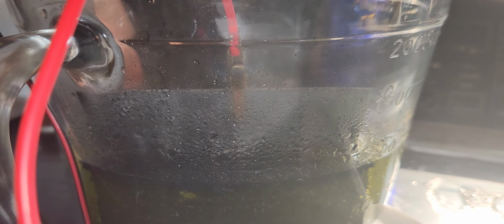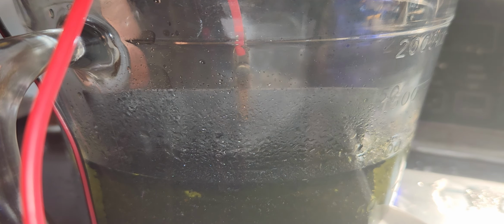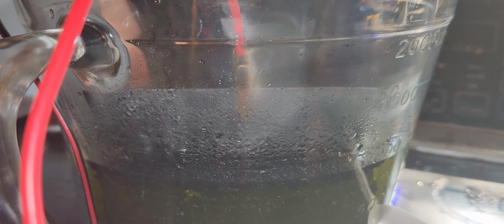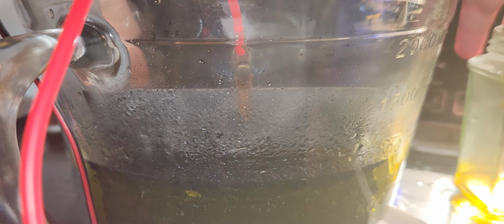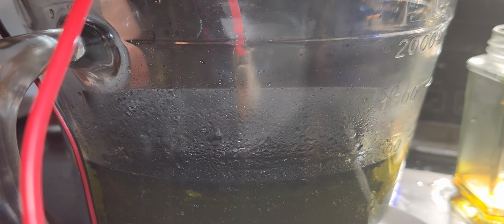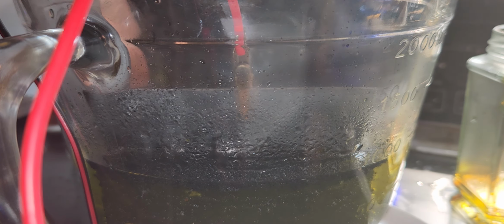What is this experiment? The negative is a copper electrode, which is in Dragendorff reagent with distilled water. As you can see right here, this is a little bit of solution of Dragendorff reagent, which I put a bit more potassium iodide into. And it's Dragendorff reagent, which is bismuth. It's potassium bismuth iodide, or potassium iodide plus hydrochloric acid and bismuth triiodide, and tetraiodide. So the complex.